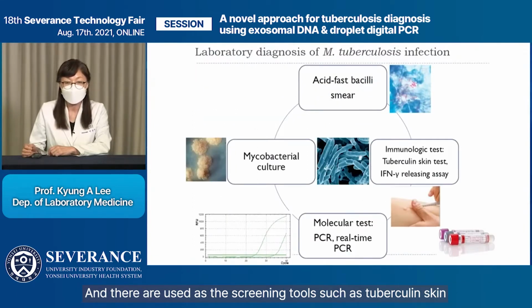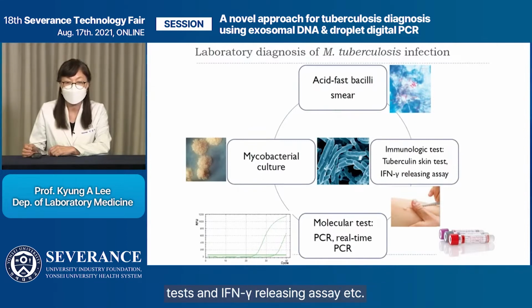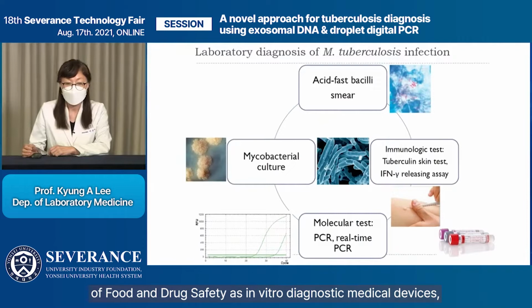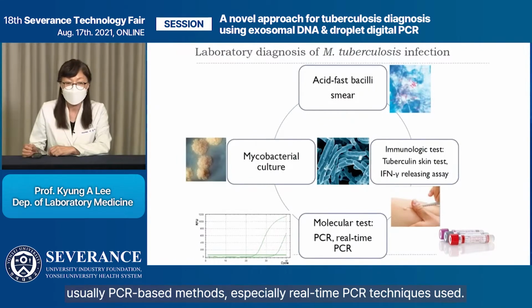And there are screening tools such as tuberculin skin tests and IFN gamma-releasing assays, and molecular tests are used as another tool, mainly with the approval of the Ministry of Food and Drug Safety as in vitro diagnostic medical devices, usually PCR-based methods, especially real-time PCR techniques.